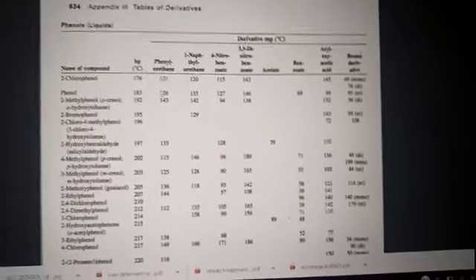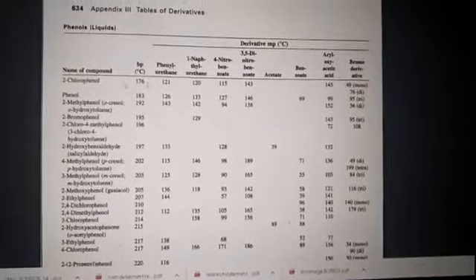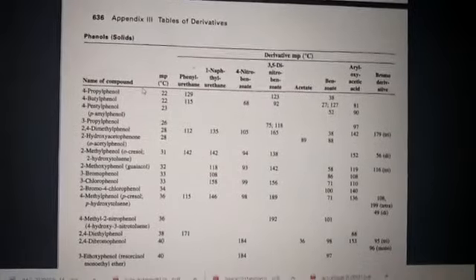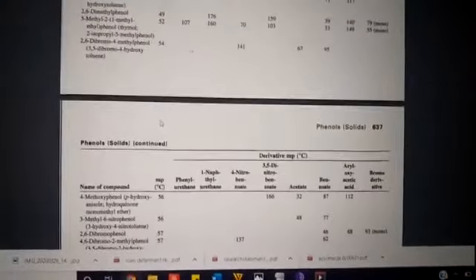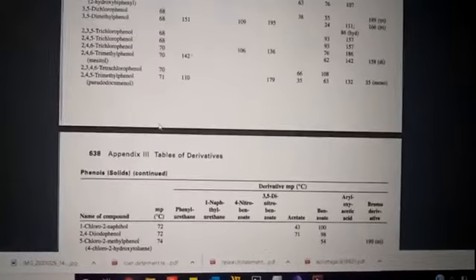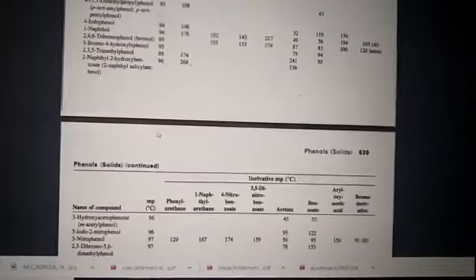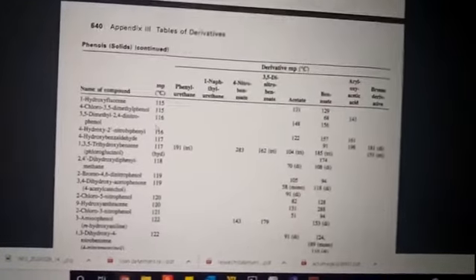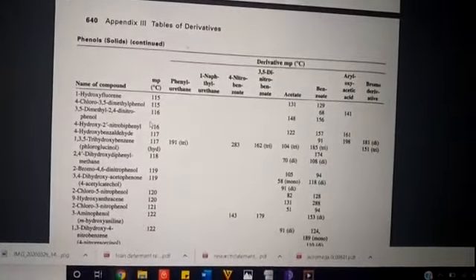The PDF starts out with liquid samples, so you would scroll past the liquids until you found the beginning of the solids. It starts at the lowest melting point, and you would find the ones that are in the ballpark of that 119 to 121.